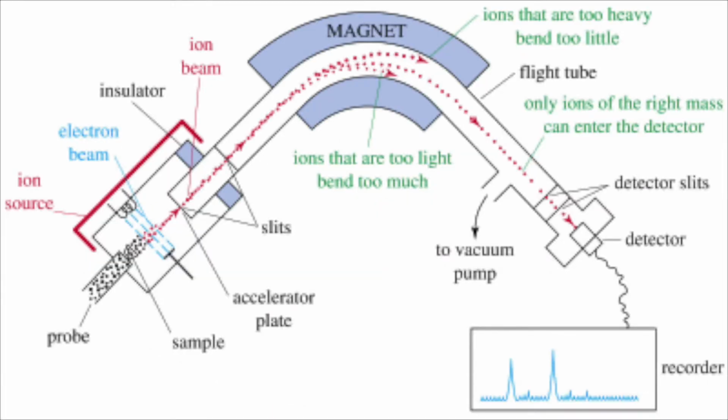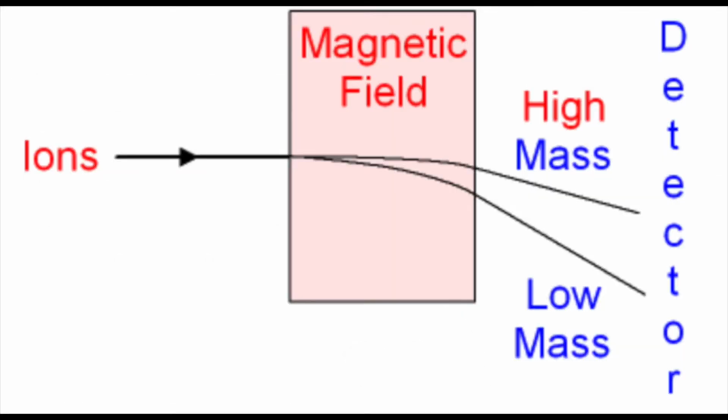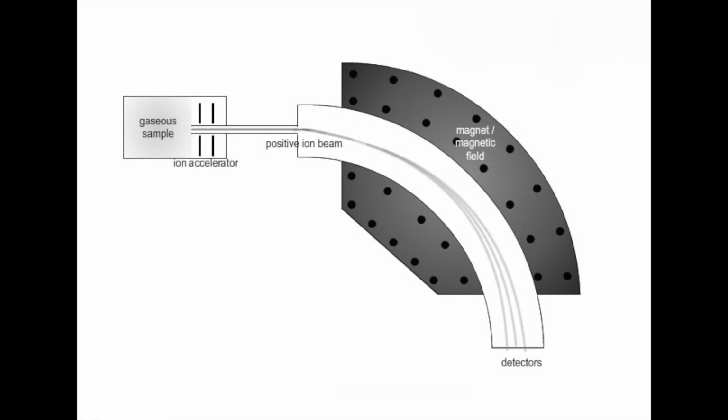An extraction system removes ions from the sample, which are then accelerated through the mass analyzer and onto the mass detector. The different masses of the fragments allow the mass analyzer to sort through the ions with a mass-to-charge ratio. This is also where the ion speed is achieved, and electromagnets are used to ensure the speed is the same for all ions.